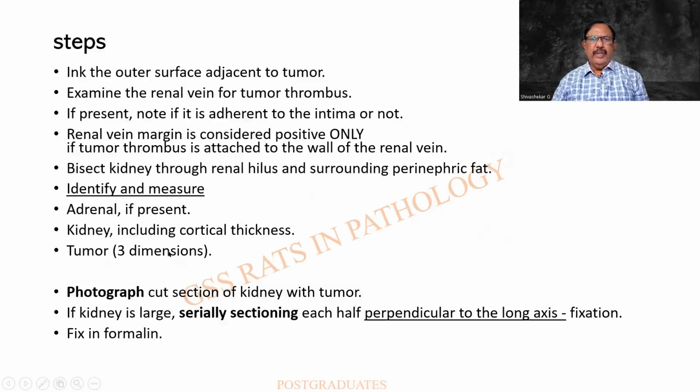Photographing of the section. This is extremely important. We always expect the postgraduates to draw a diagram, but still better will be an immediate photograph. Nothing will be equal to the original picture of it. In fact, the surgeons are requested not to slit the specimen and examine it in the theatre on their own. Serial sectioning can be required for a large tumor or additional details.